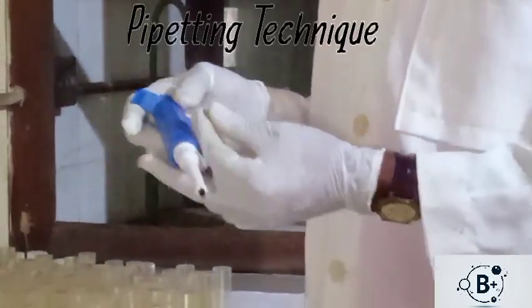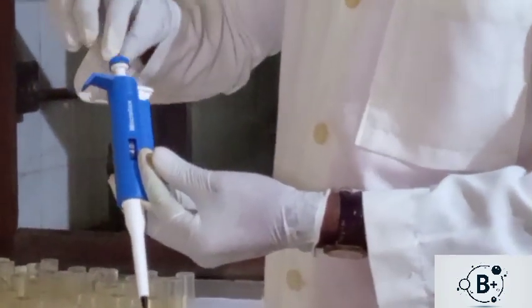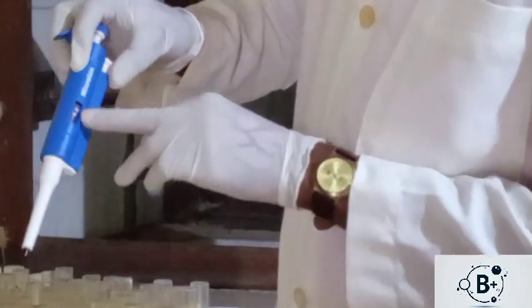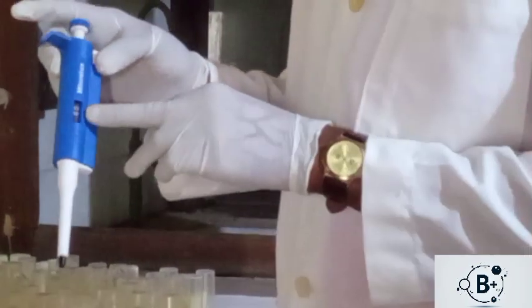So what I do is I will do 50 first. I will adjust it. This is the adjustment dial. So the adjustment dial is here. I will now set it here. I will be looking at this interface to see it move to 50. So this is 50 microliter, as is seen here.